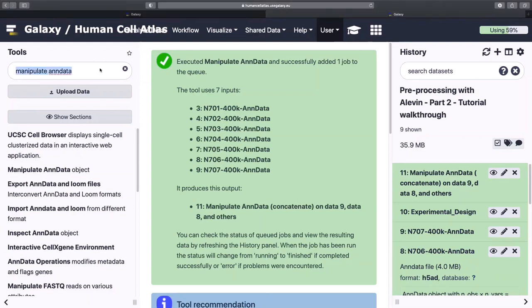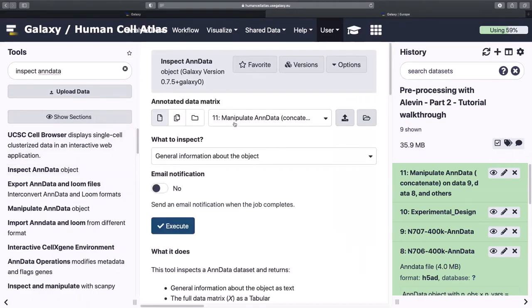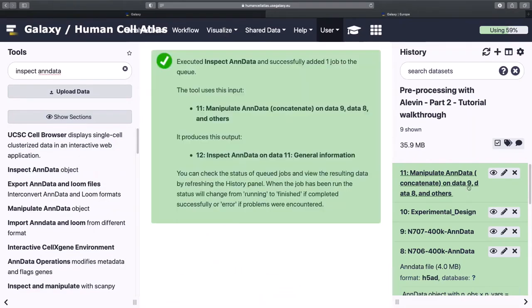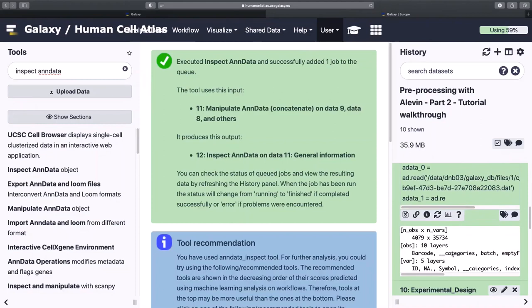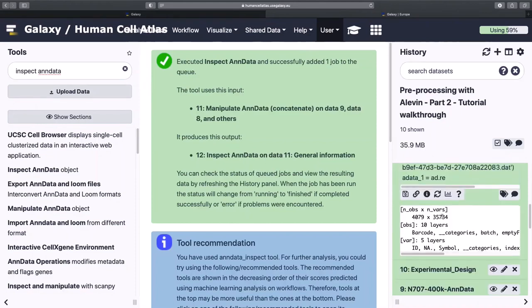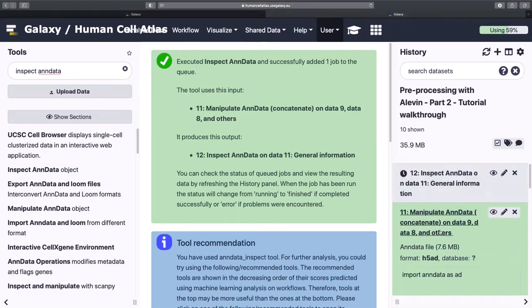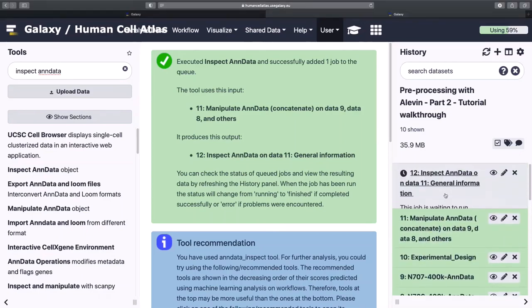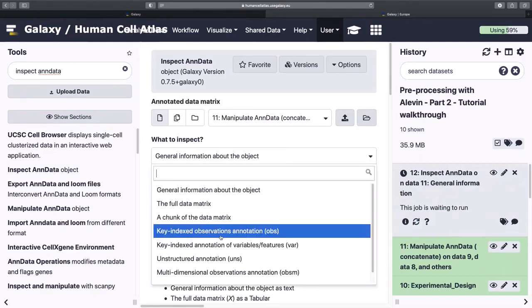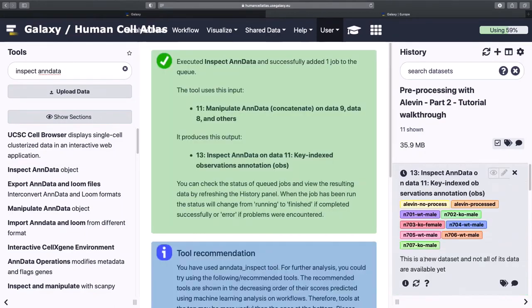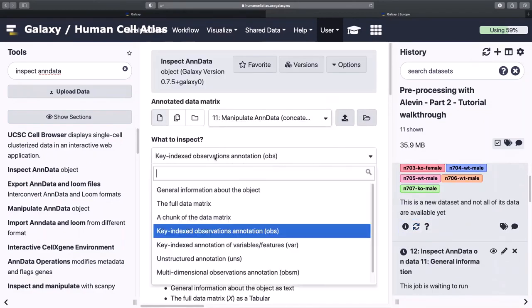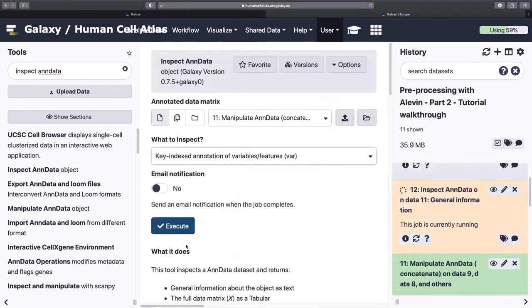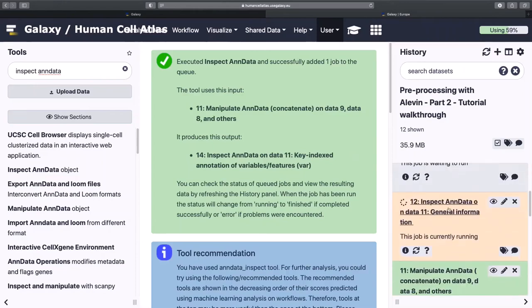And now we can use one of my all-time favorite tools and we're going to learn all sorts of stuff. To be fair, what's cool now is that you could look in this little window and get all sorts of information about your object, which is awesome and didn't used to exist. So gold star to the developers of that, which I believe one of them is Mehmet. We can get even more information by running this, get me the more information tool, which will prove very useful to you when you're trying to manipulate your metadata, which we're going to be doing so soon.